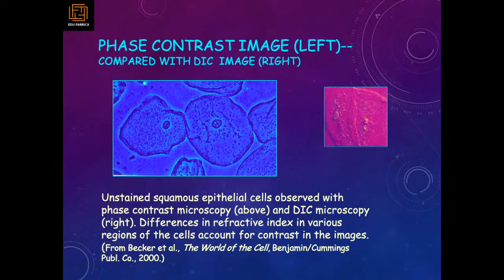So we can see that it's very fine, we can see the nucleus, everything is better here, more defined, we can see the cell membranes quite better. But the organelles, the cell organelles inside them, the membrane ones and non-membrane ones, are not very well defined. We cannot say what is what. Even though it's quite magnified, things are pretty much good, but still it might not be as good as other microscopes.